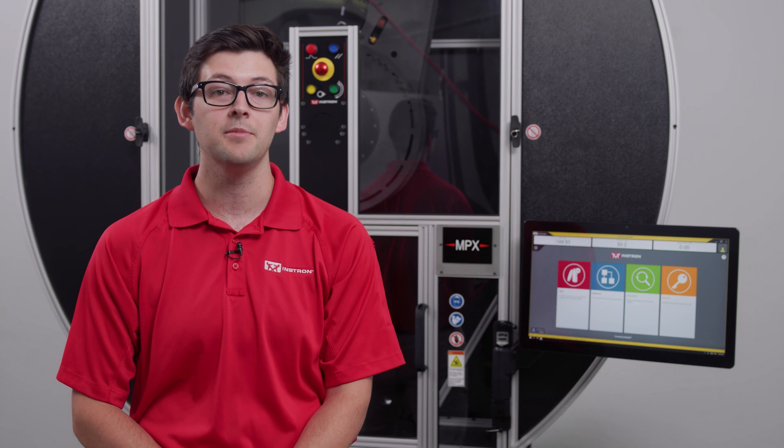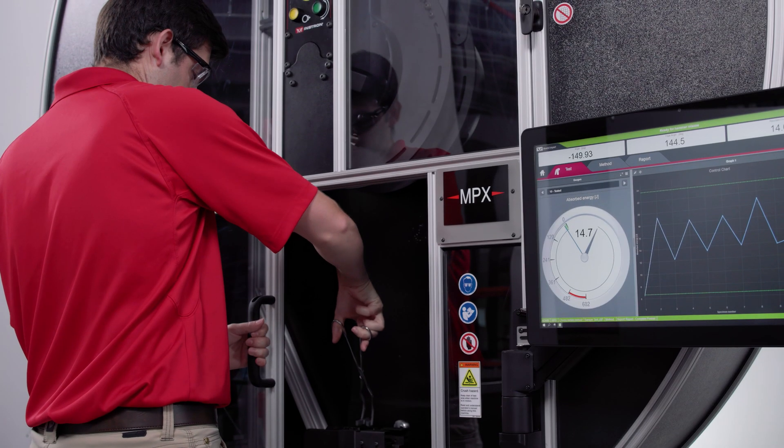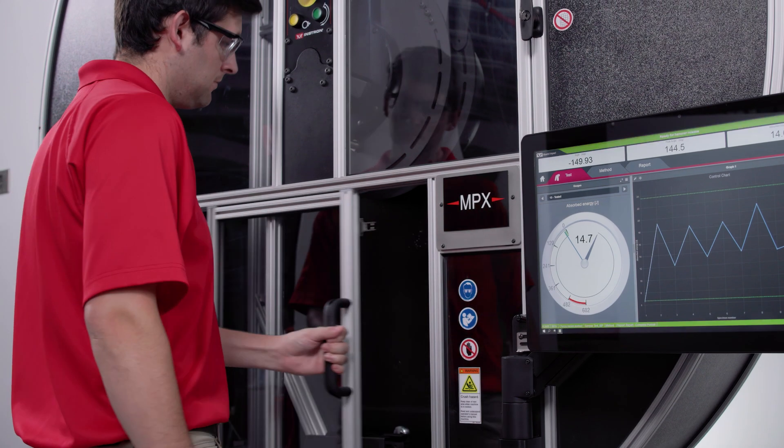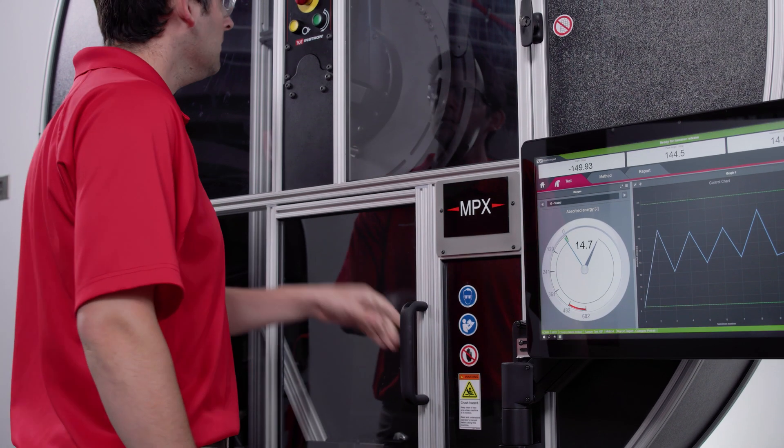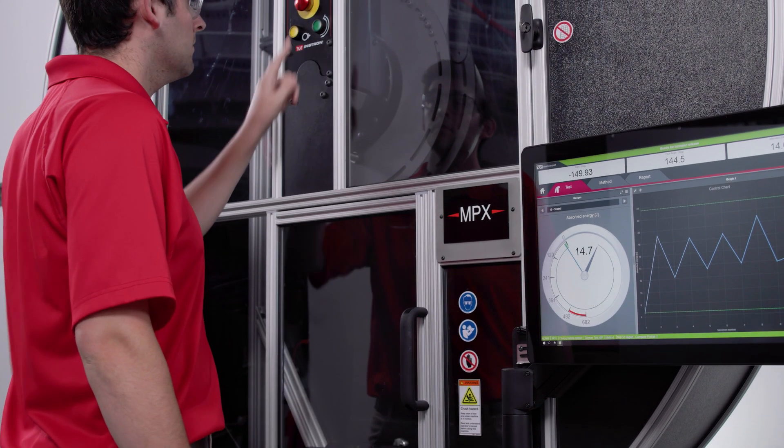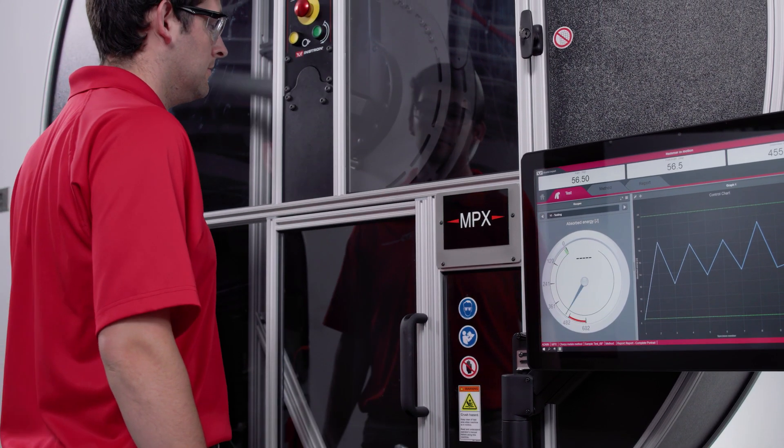The MPX uses a high resolution digital encoder, which is essential for measuring high and low ranges per stringent ASTM and ISO standards. Even our highest capacity MPX at 900 joules is capable of testing as low as one joule, allowing you to take full advantage of the system's capacity.